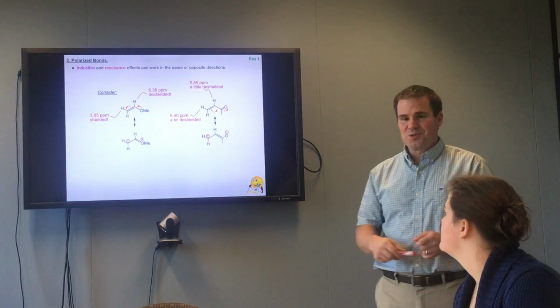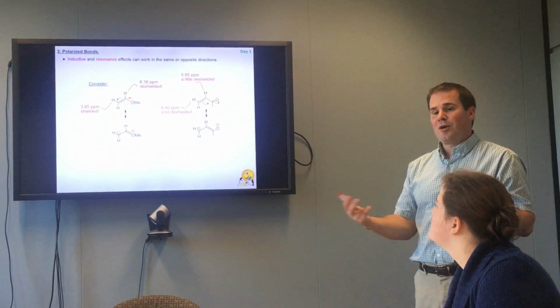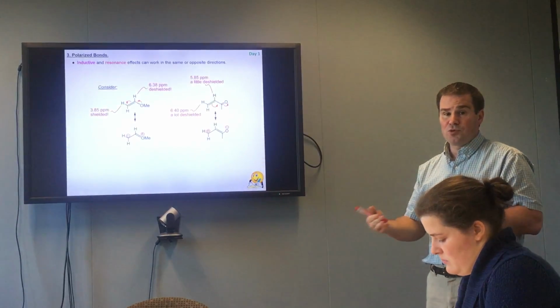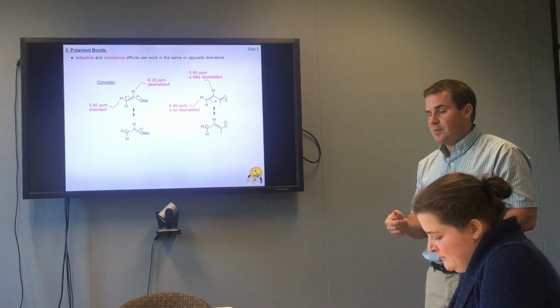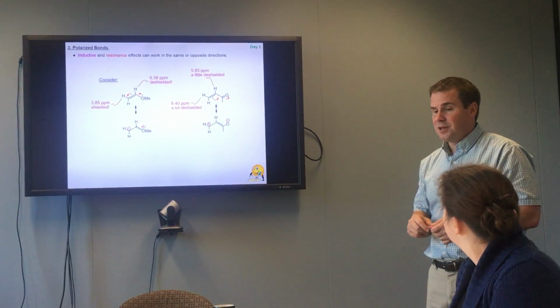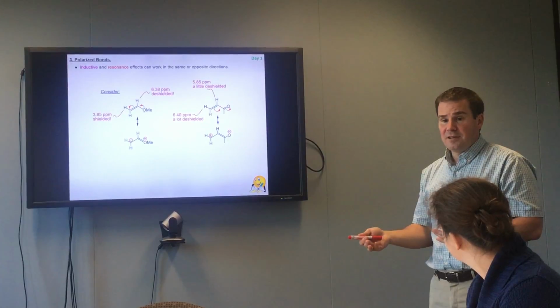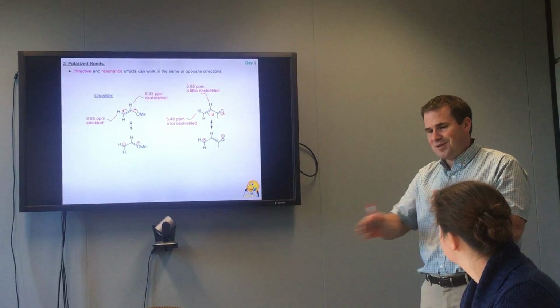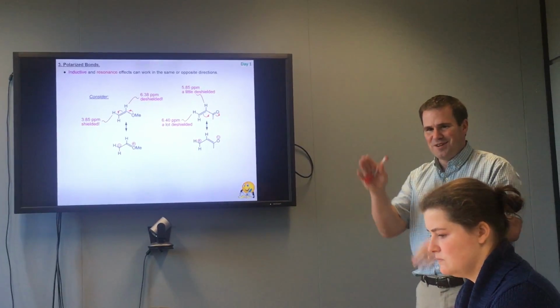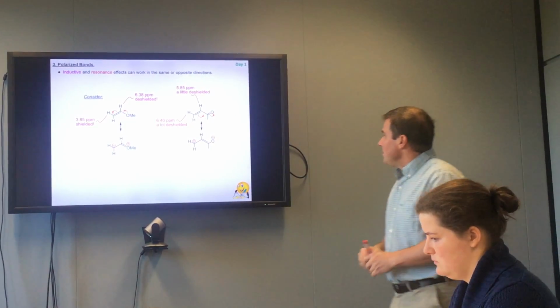Again, chemistry is real, right? We get this direct readout of the chemical properties of the molecule by looking in the proton NMR. You can actually use the proton NMR chemical shifts, if you're very careful about things, to predict things like nucleophilicity of a series of functional groups, as long as you're all comparing within the same kind of series and not jumping around too much. What about the enone?